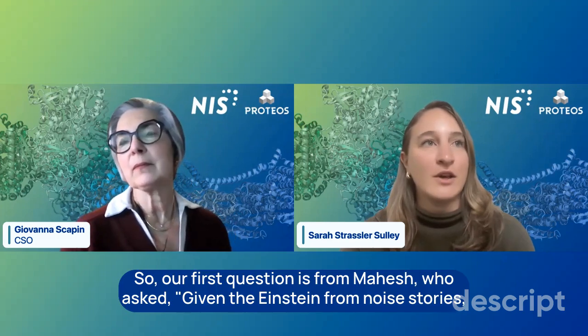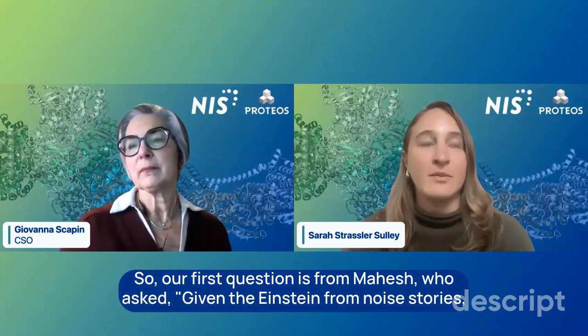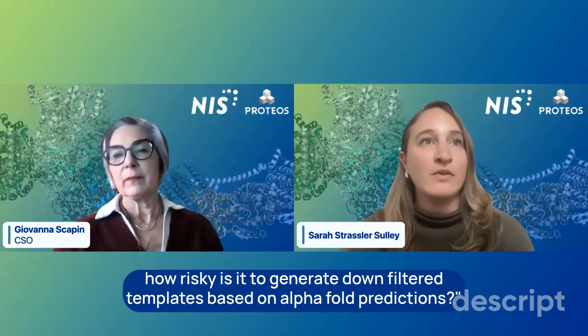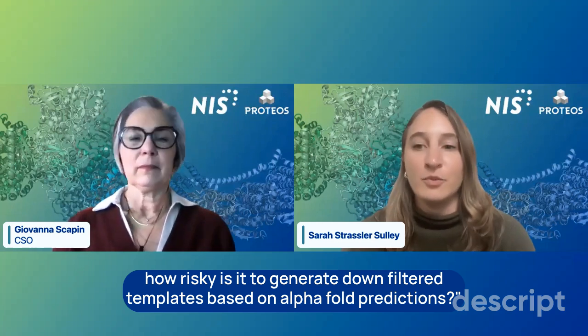So our first question is from Mahesh, who asked, given the Einstein from noise stories, how risky is it to generate down-filtered templates based on AlphaFold predictions?